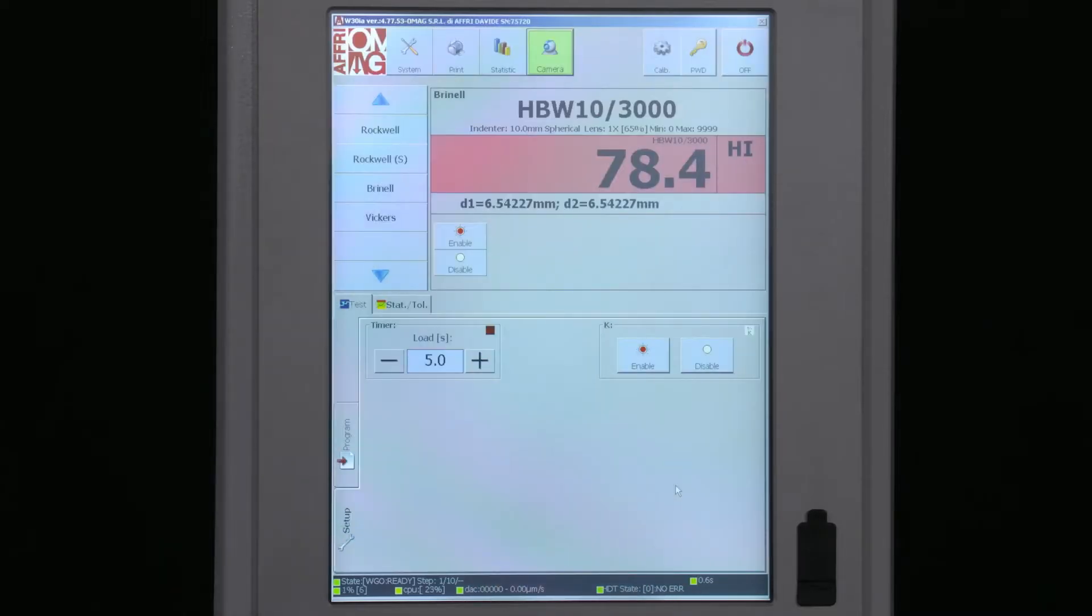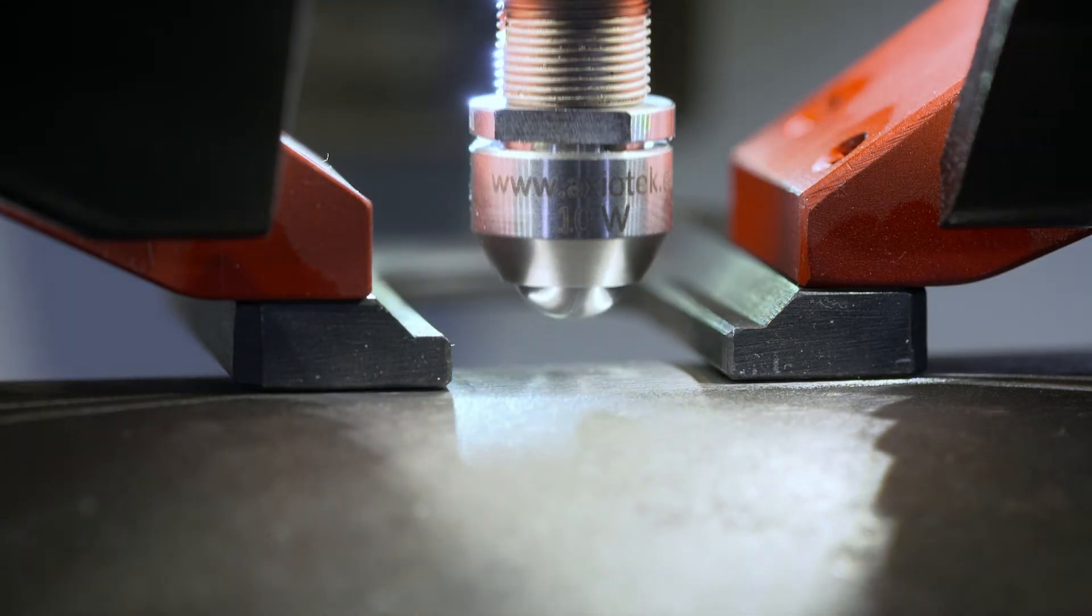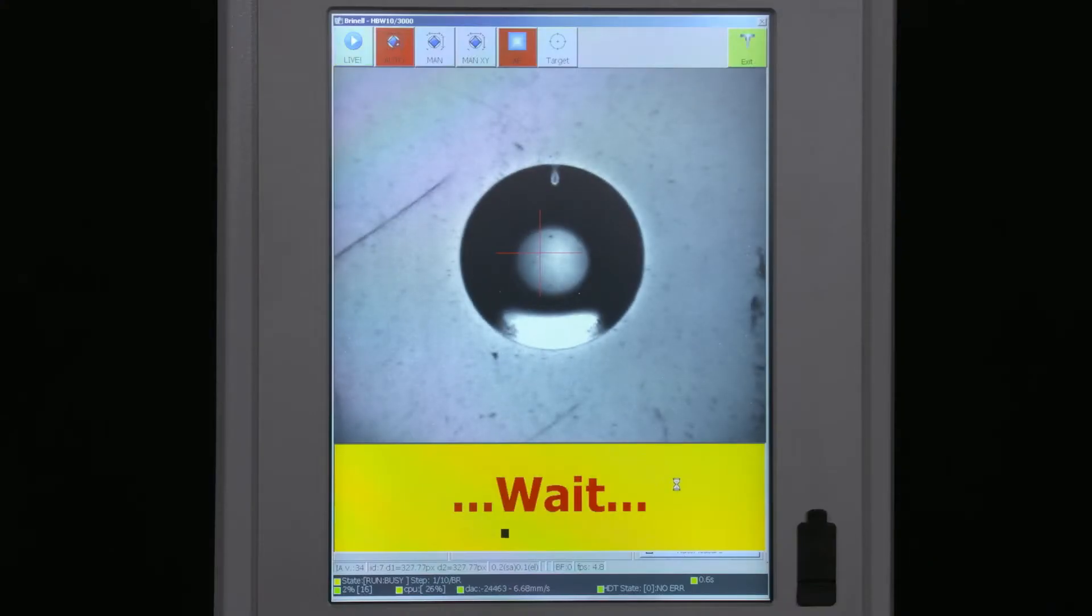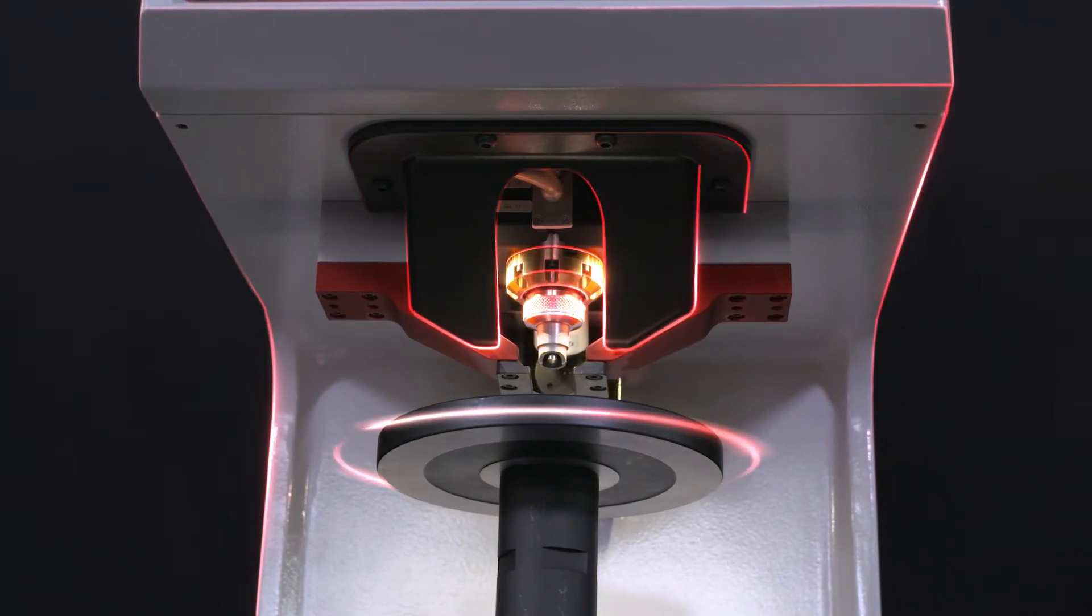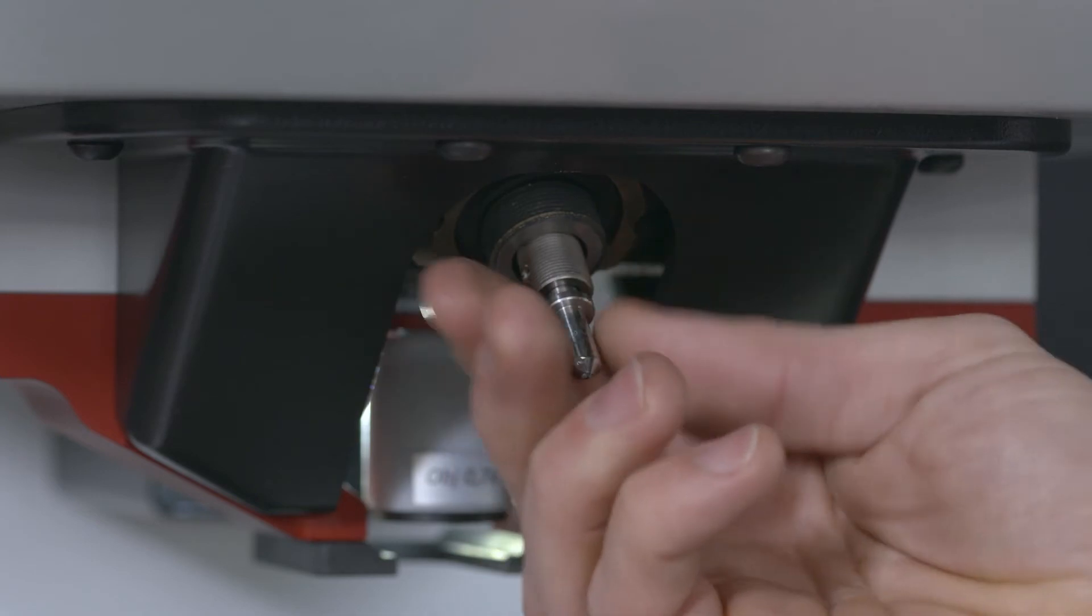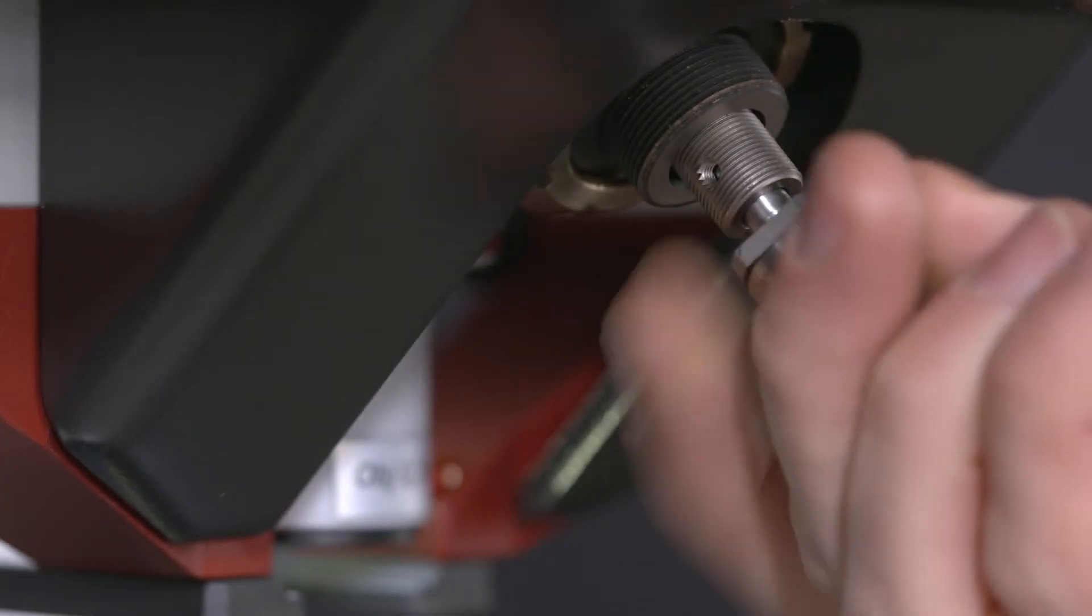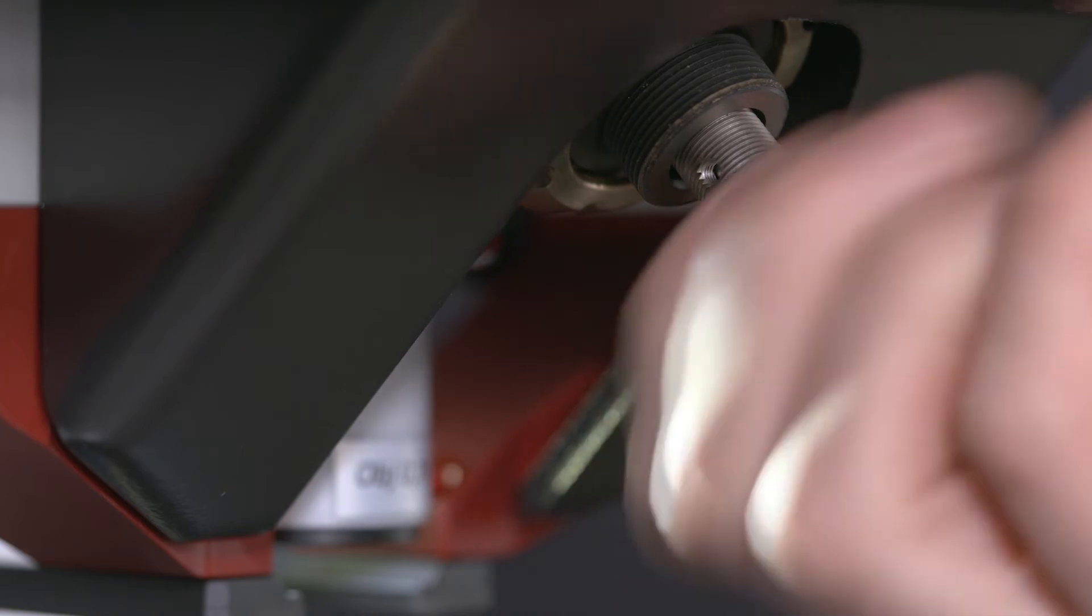It operates autonomously and produces the reading with a single command on the touch screen. The fully automated operation saves time and prevents human error. It can be used to carry out hardness tests on various scales with no need to install other testers.